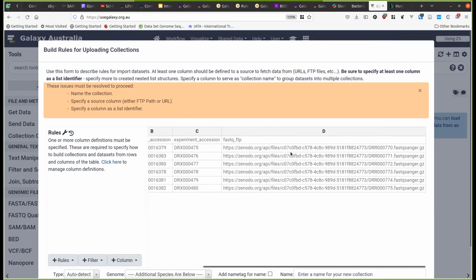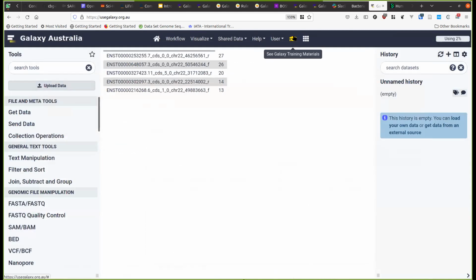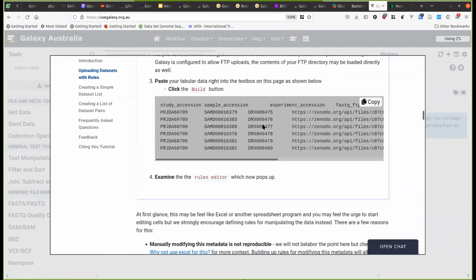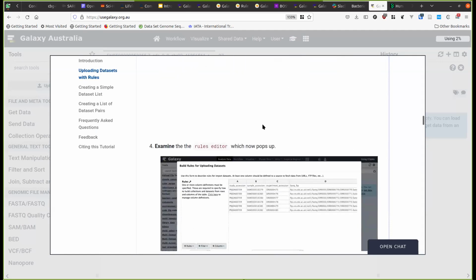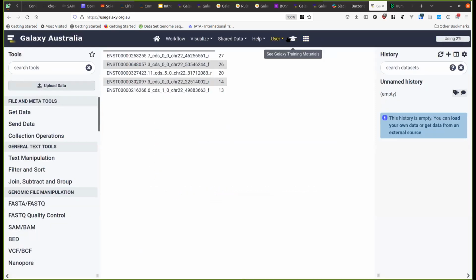Here's some files. This is where the data is located. And now we want to make some rules, okay? This one is not as easy to use with a little tool, with a little hat icon. But I just want to illustrate a few things about it.